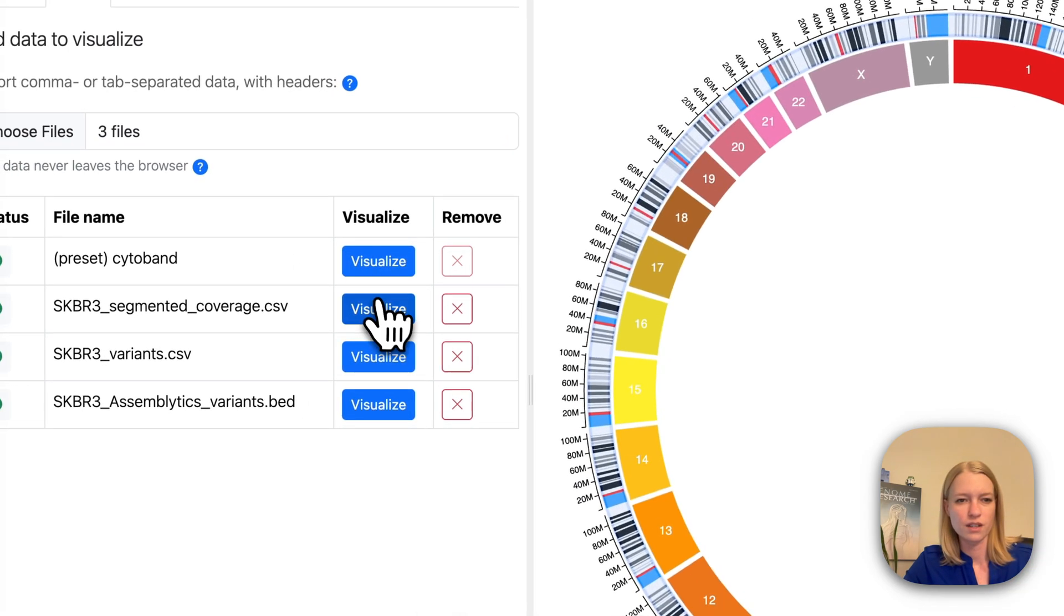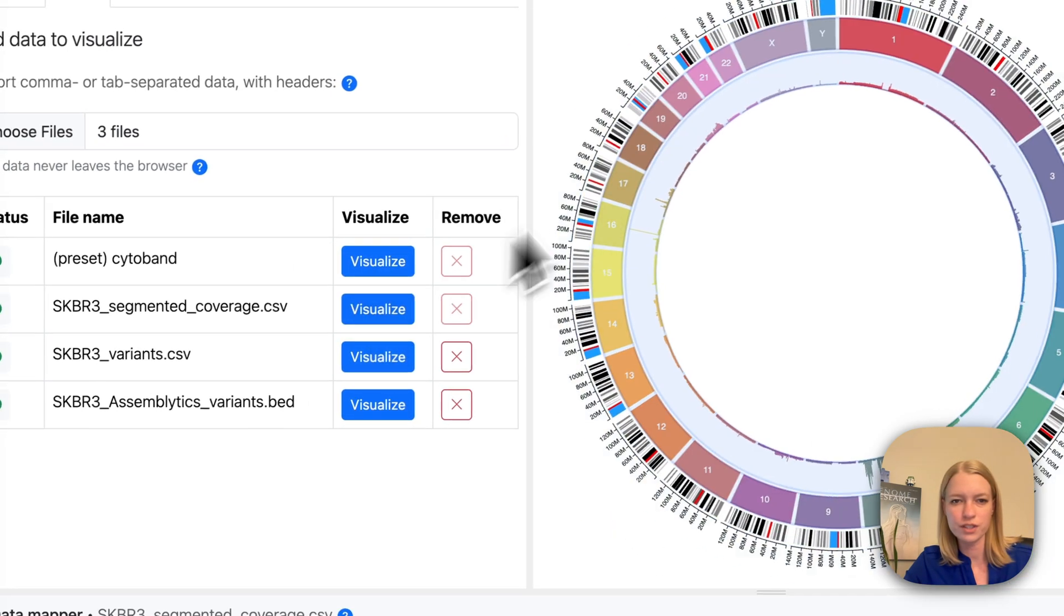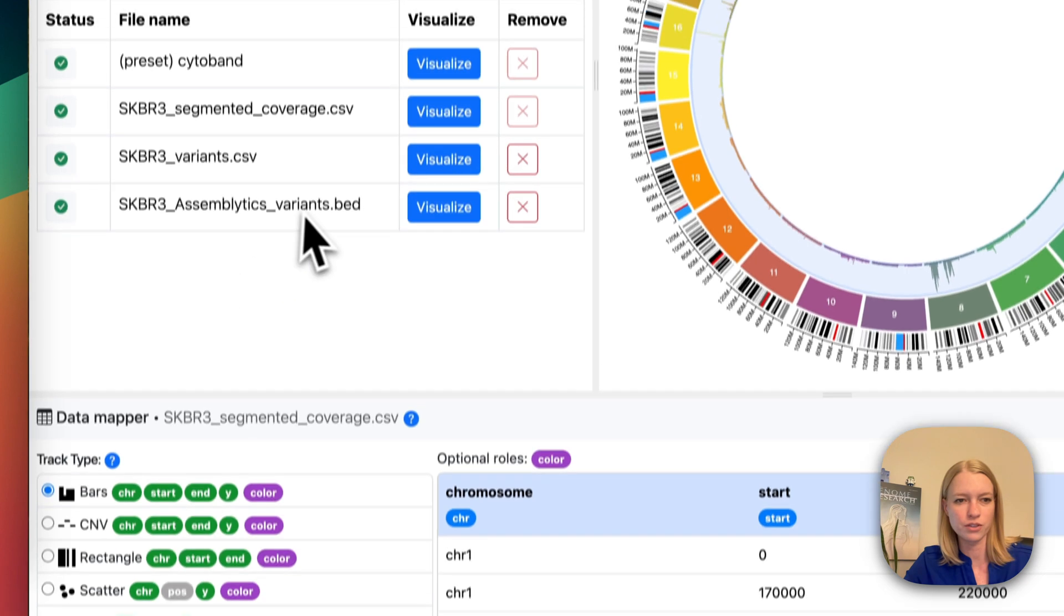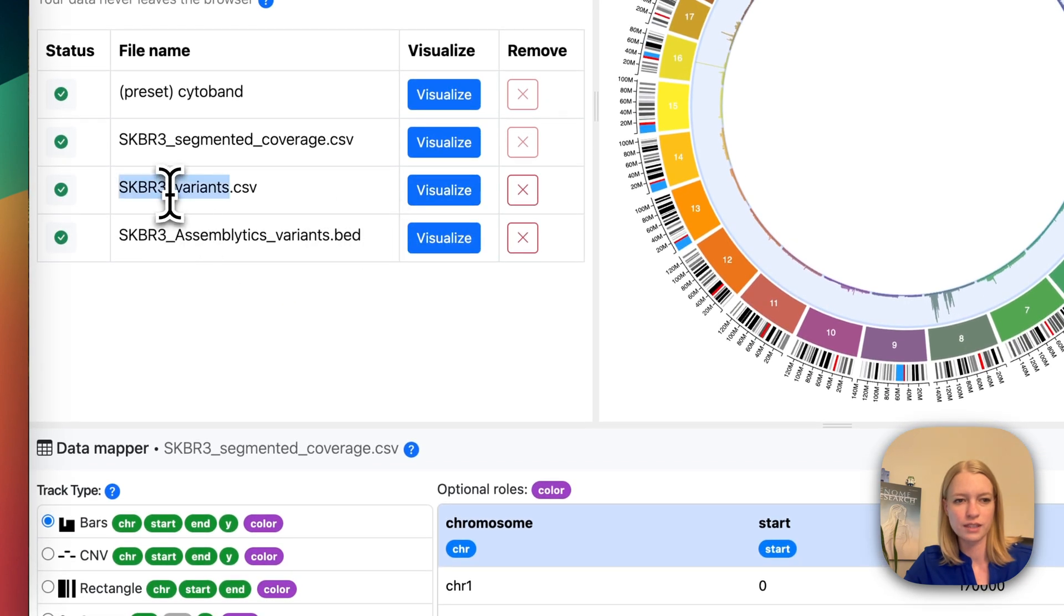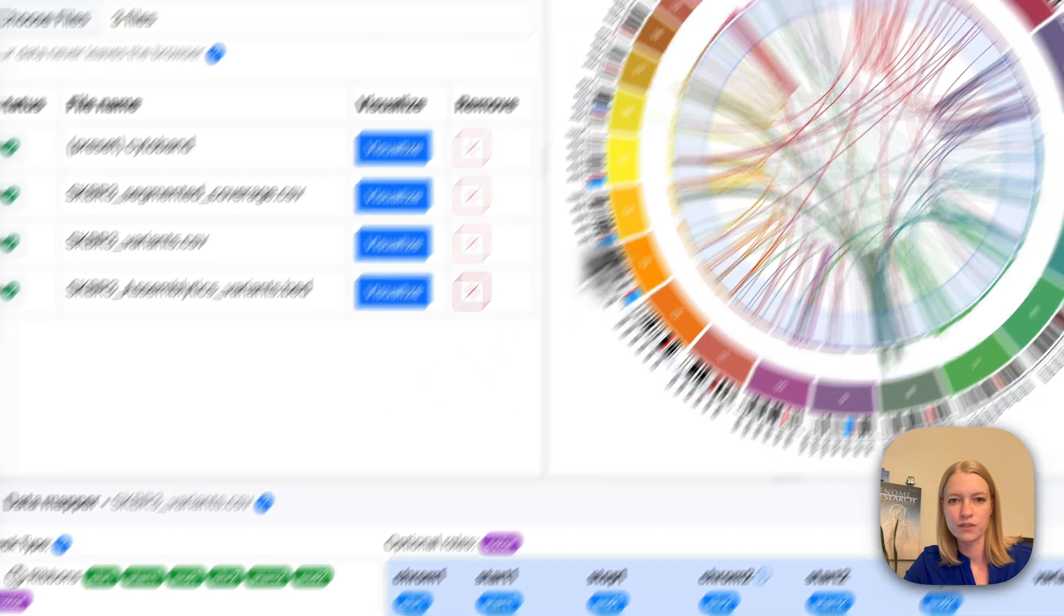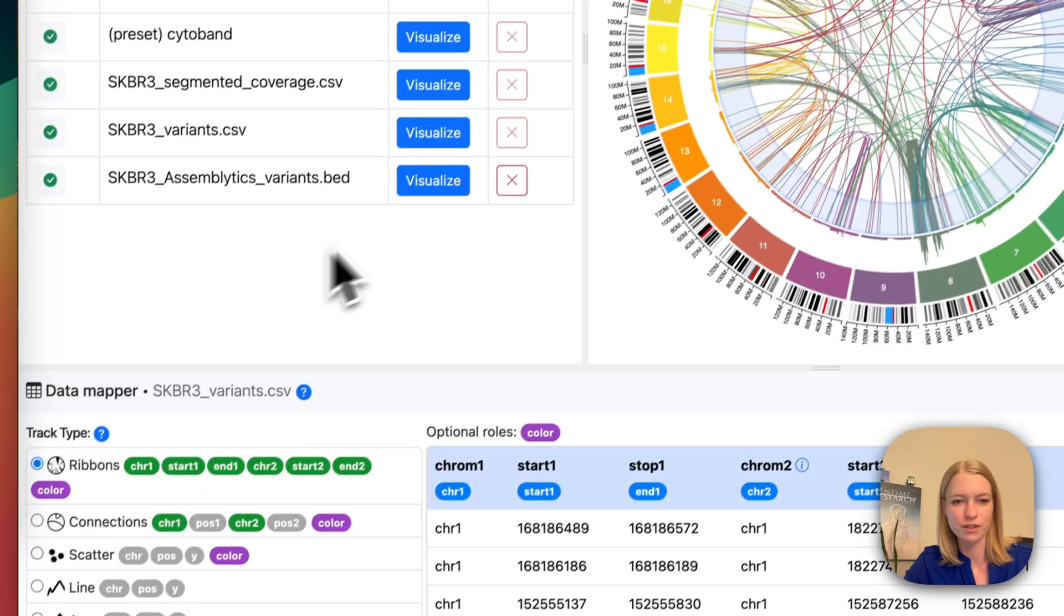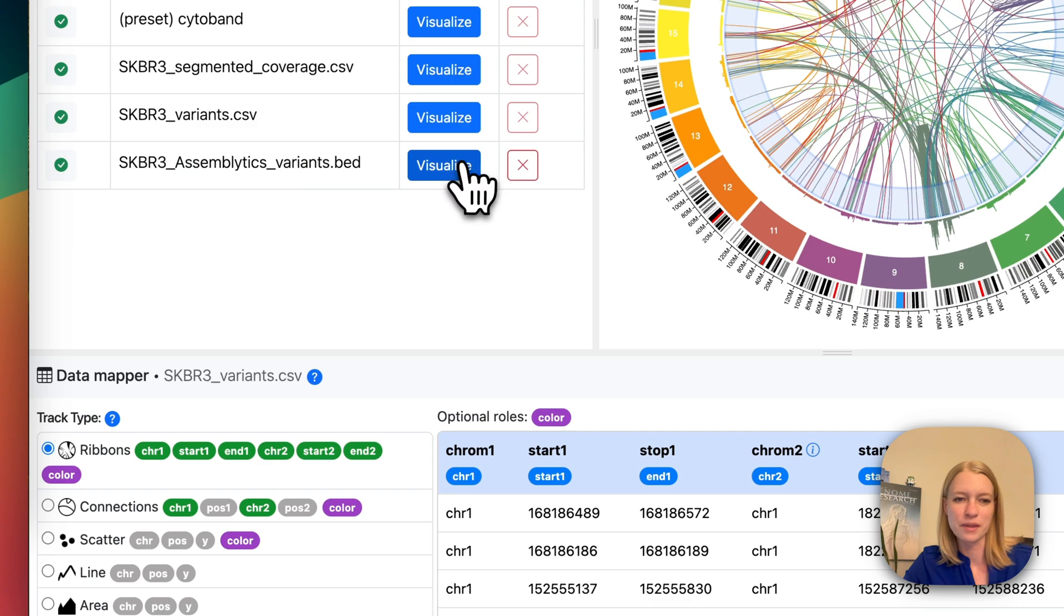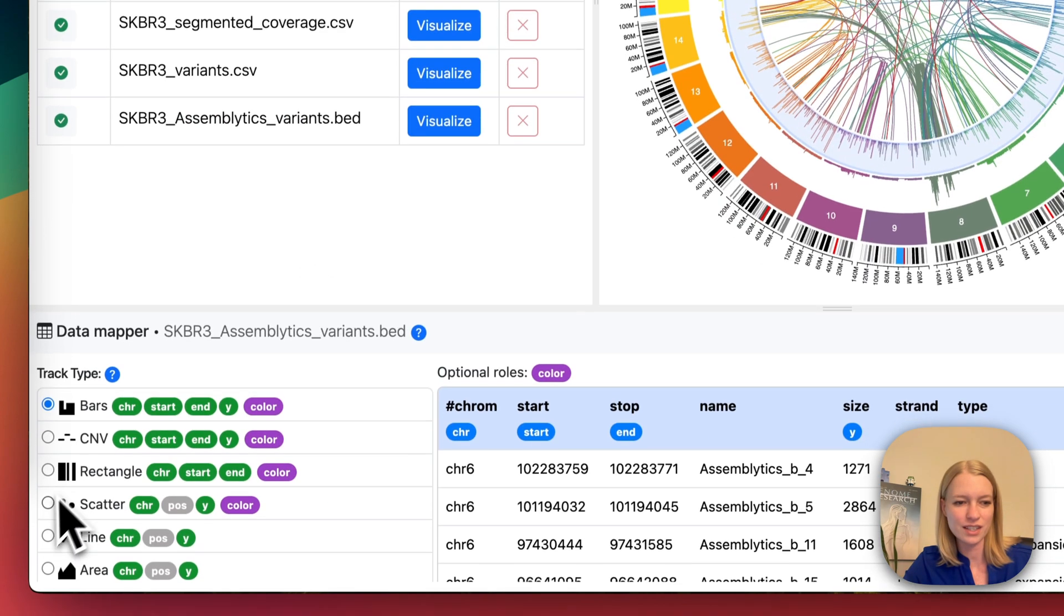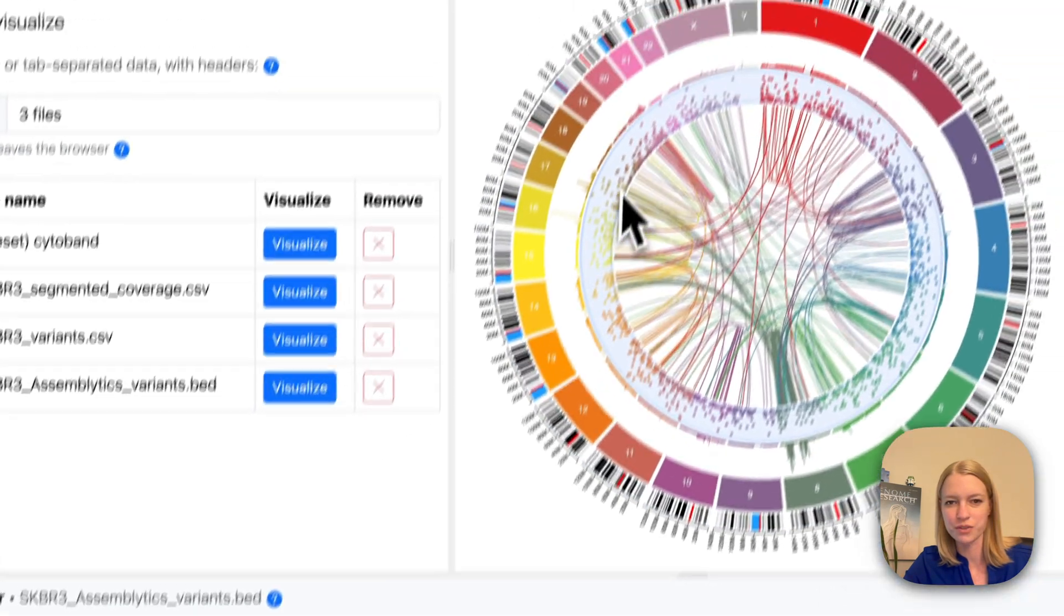Let's visualize the coverage first. That gives us a nice bar chart. Let's visualize the variance, which gives us connecting ribbons because these are long-range structural variants. And then the Assemblytics variants are small structural variants.